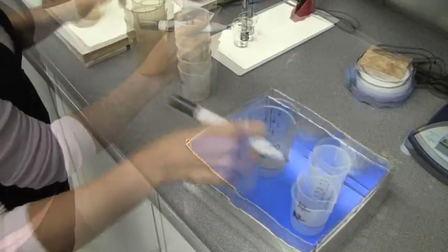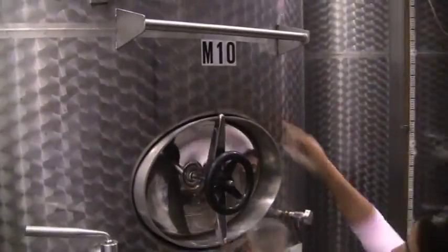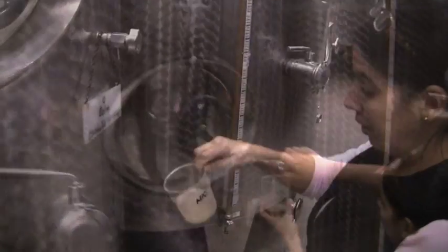Well, everyone, I'd like to introduce you to Anna. Anna is getting ready to collect some samples in the cellar. And why? Well, today we are going to try and find out, as we've been talking about, what are the alcohols?